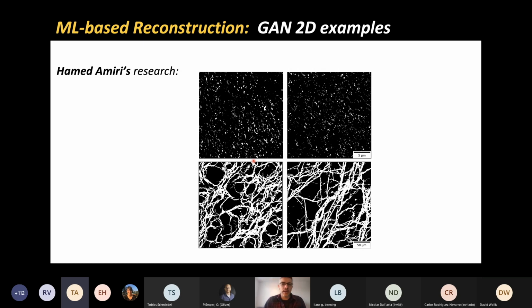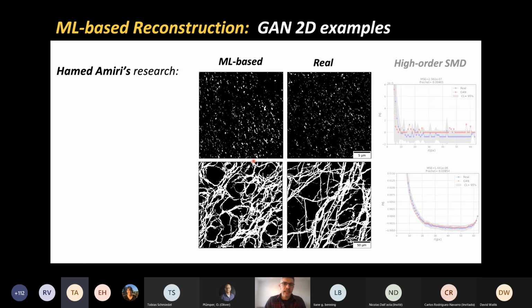If I asked you to decide which one is real and which one is not, you're probably debating. If you're an expert on these specific types of rocks, you may be able to tell, but if we look at the collection of our images, even Ollie, who's an expert, is pressed to say which one is real and which one is not. So this works really well. The ones on the left are reconstructed by machine learning. The ones on the right are actual real samples.